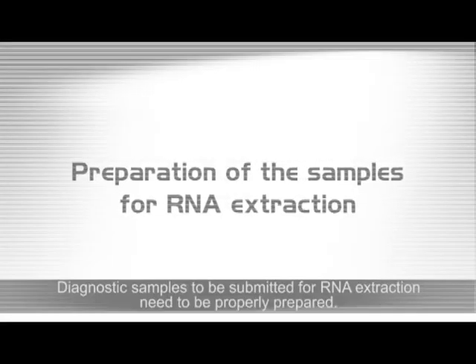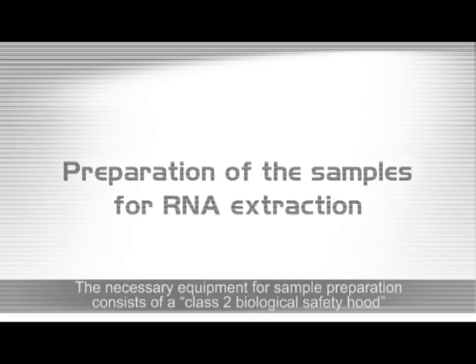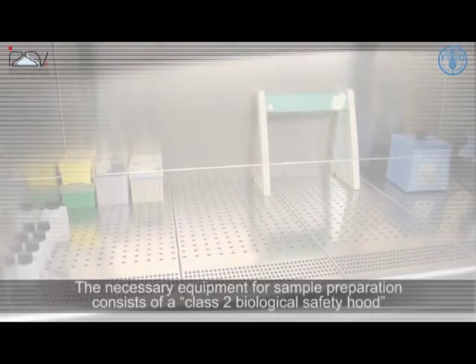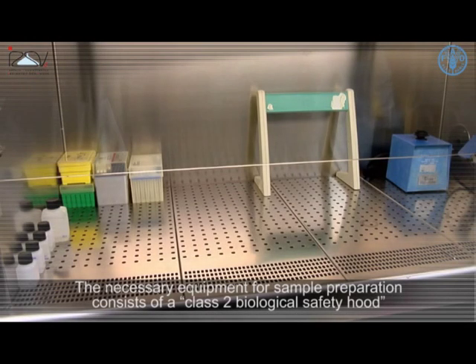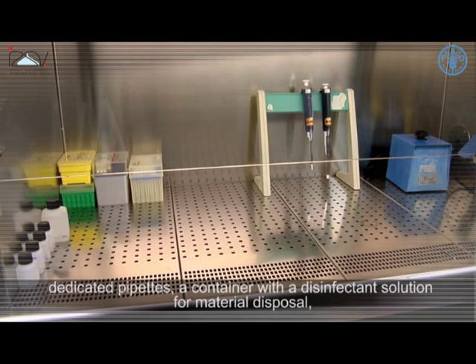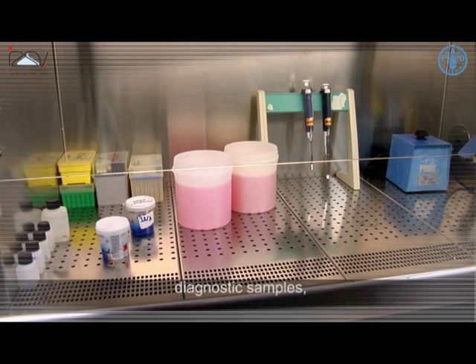Diagnostic samples to be submitted for RNA extraction need to be properly prepared. The necessary equipment for sample preparation consists of a class 2 biological safety hood, exclusively used for nucleic acid extraction, dedicated pipettes, and a container with a disinfectant solution for material disposal, along with the diagnostic samples.